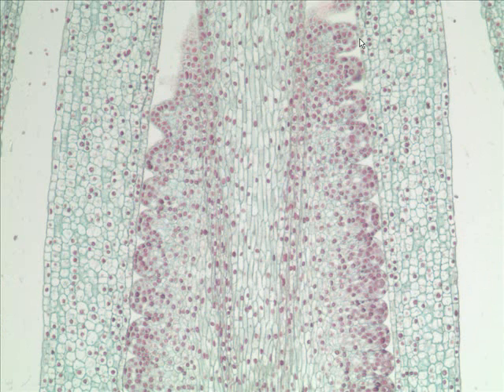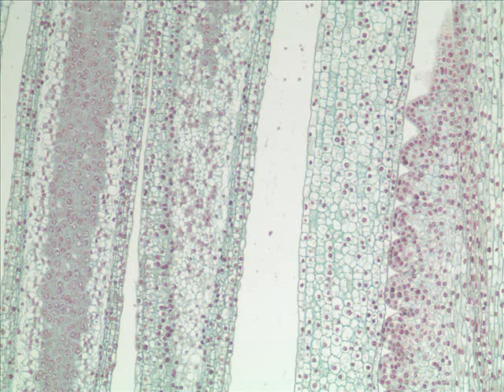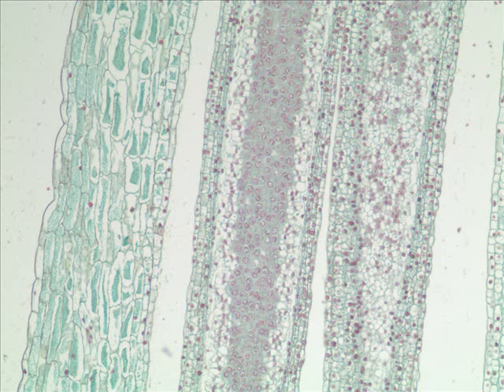Within the ovary, these little bumps are what? Ovules, ovules, yes. And so, moving to the left, we see the outside of the ovary. These are the ovules within. And then we see anthers, anthers. What is developing in the anthers? That's right. Pollen, pollen.